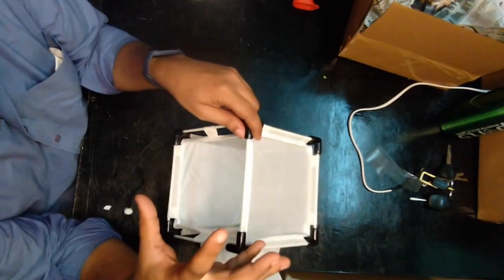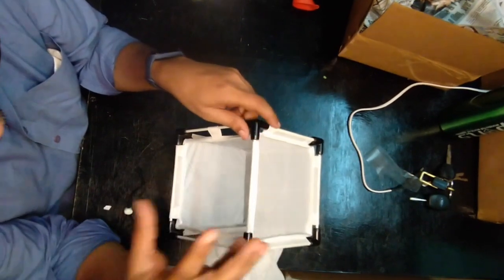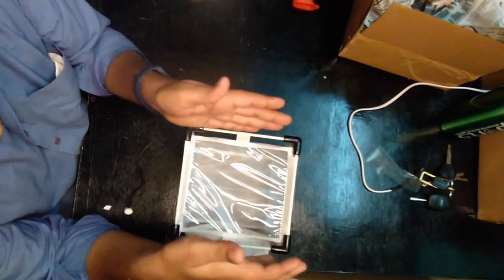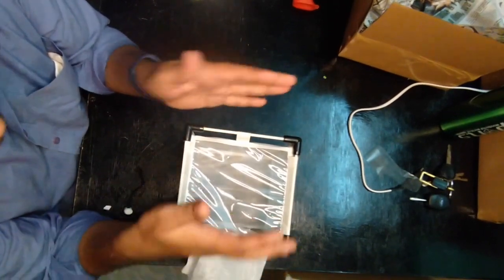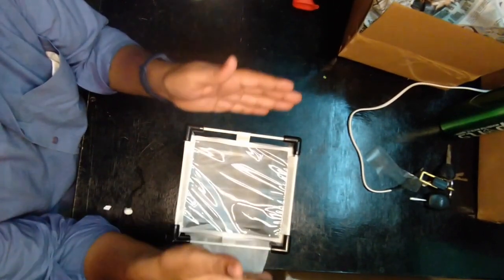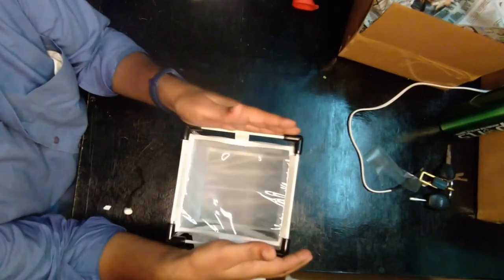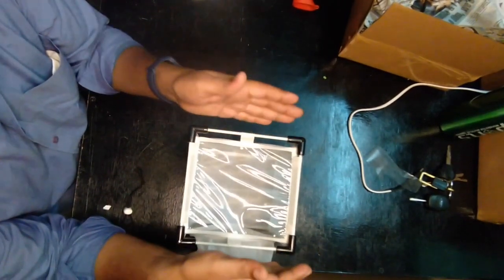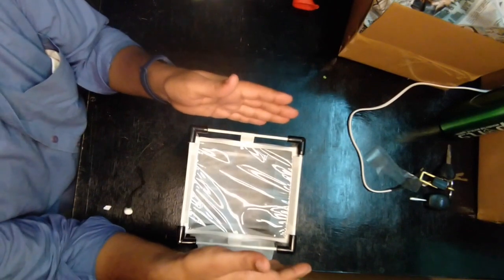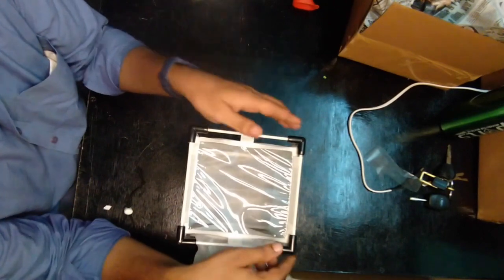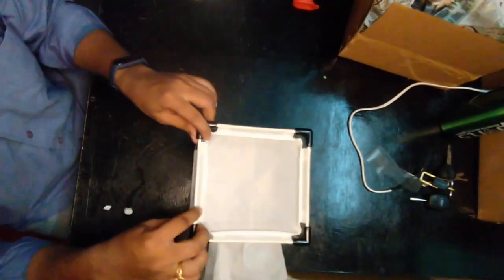This will reduce the volume that is available for rearing of the insects, requiring you to use many more cages. What you are getting here is actually what you get with the 30 centimeter cube general insect cages that have been used.